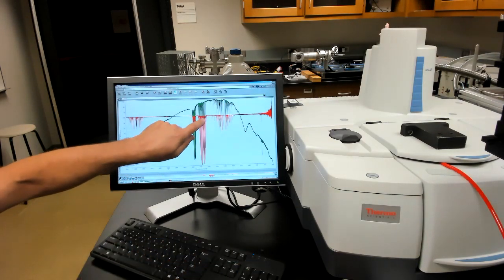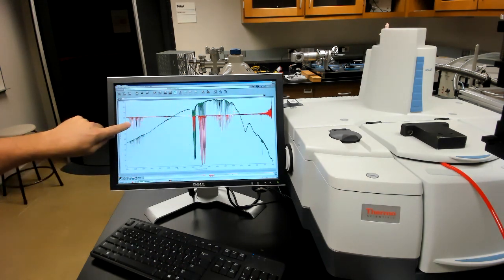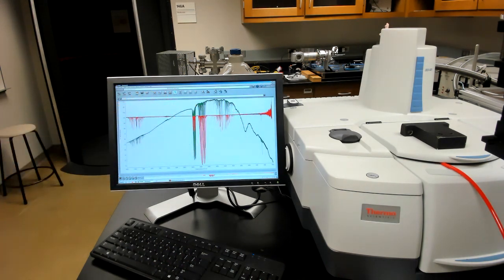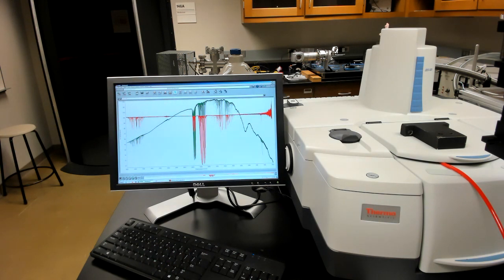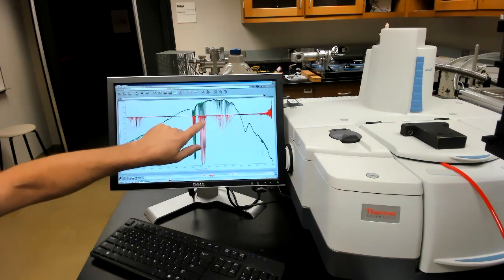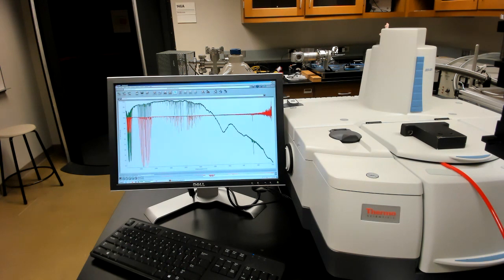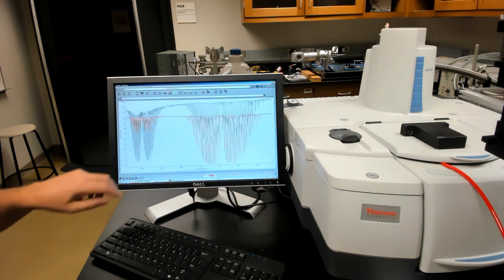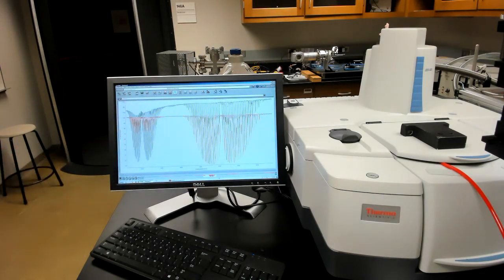Now the spectrum in red is the ratio, what's called the transmission spectrum, and the spectrum in green is still the sample spectrum. Notice that the background for the transmission spectrum is a flat line because we've divided out all the features that aren't due to the gas in the cell. Here, let's zoom in on the features of interest. And you can see that they both look great, but in the transmission spectrum, the background is very flat and clear, which is going to make analysis easier.